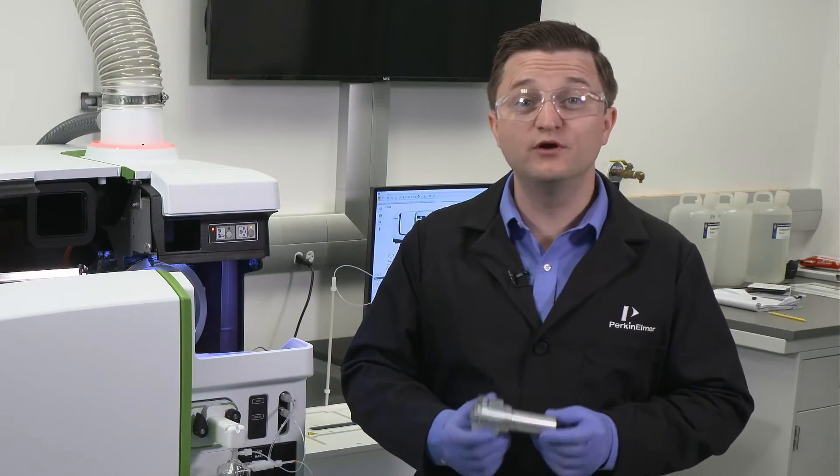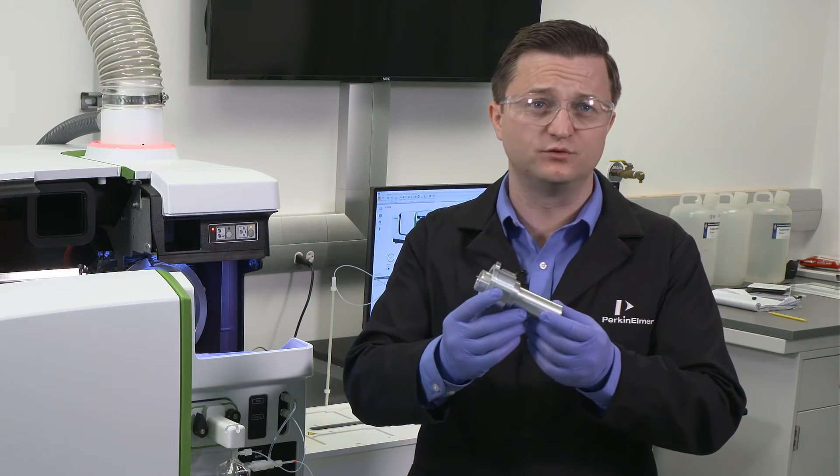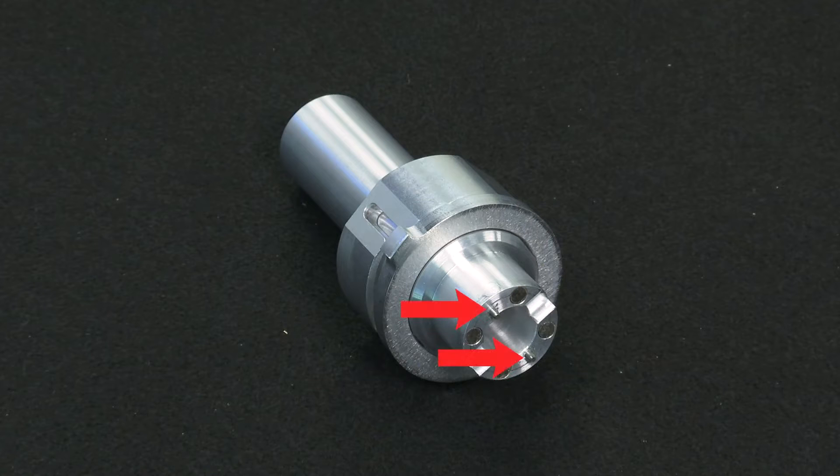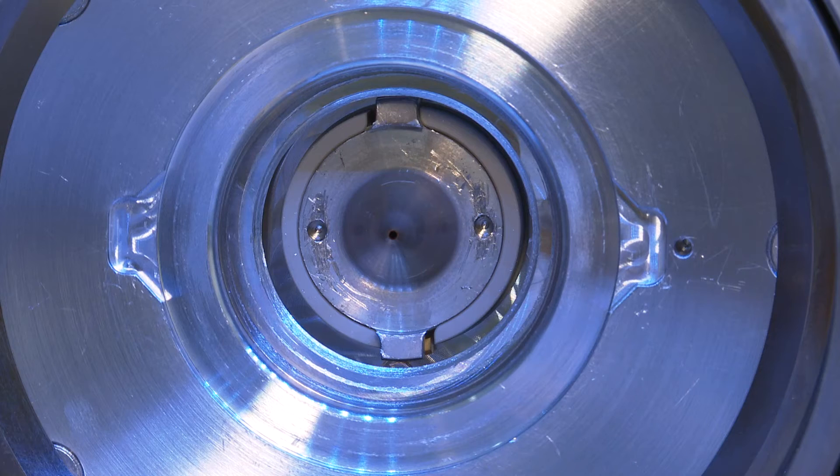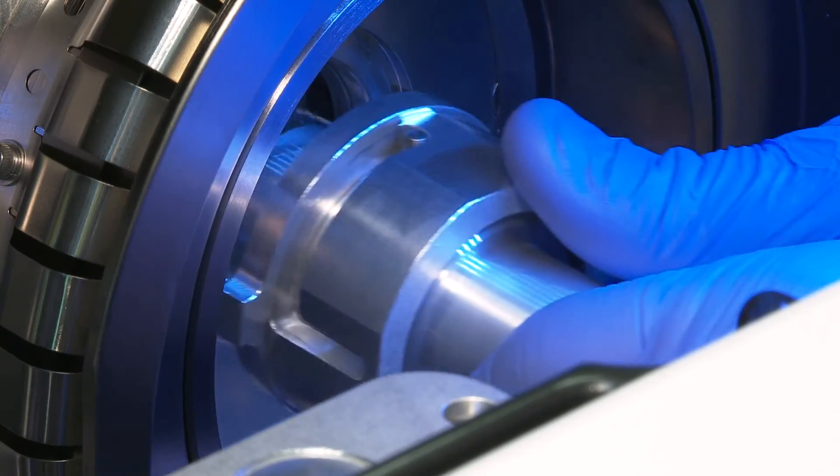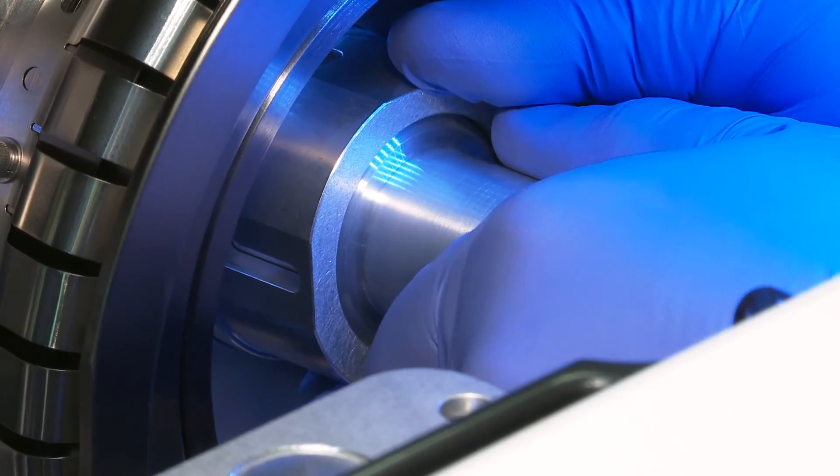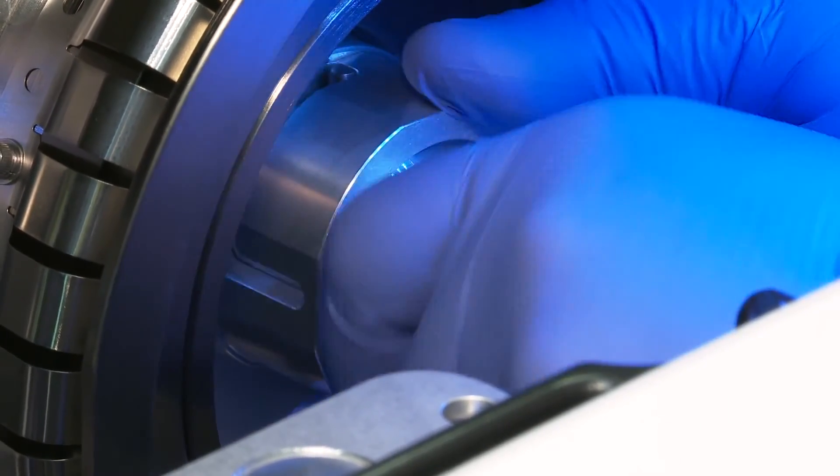Now, to remove the hyper skimmer omni ring assembly, we use the hyper skimmer removal tool that I have here. Line up the hyper skimmer removal tool pins with the hyper skimmer. Push in the hyper skimmer removal tool until the pins engage the holes. This may take some practice to master.